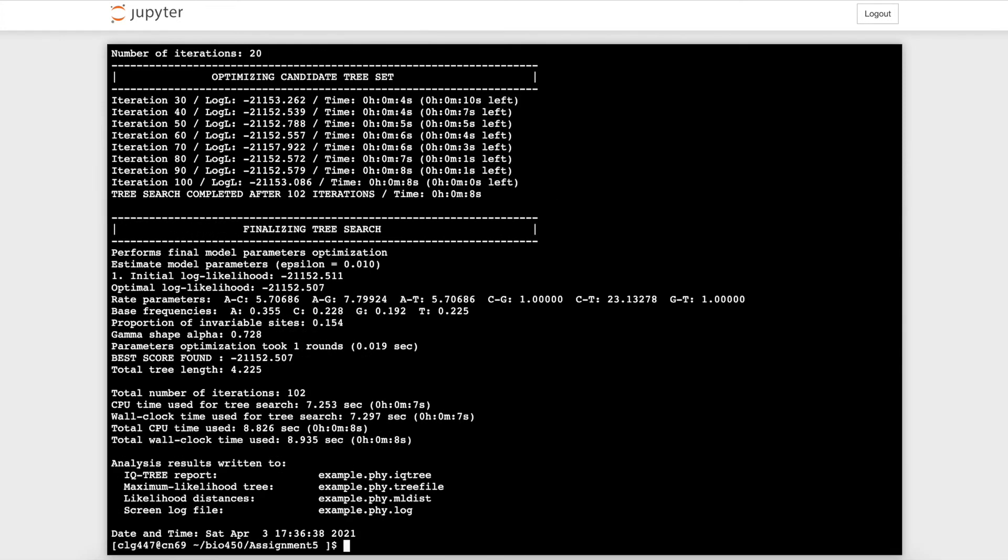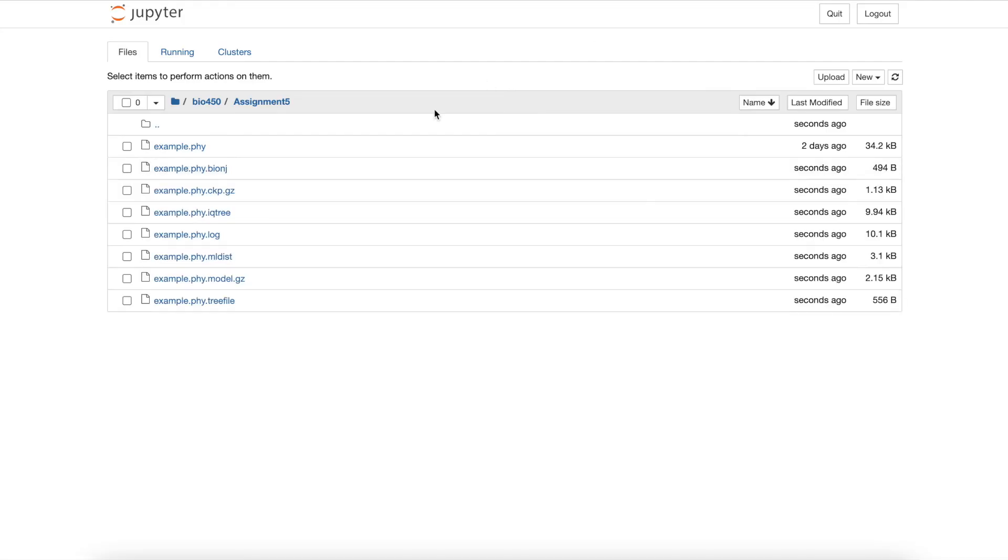The run has finished, so I will navigate back to my folder where it automatically uploads our output from IQ-Tree 2. As you can see, there are many output files after running the function, but the inferred phylogenetic tree is the main focus here.